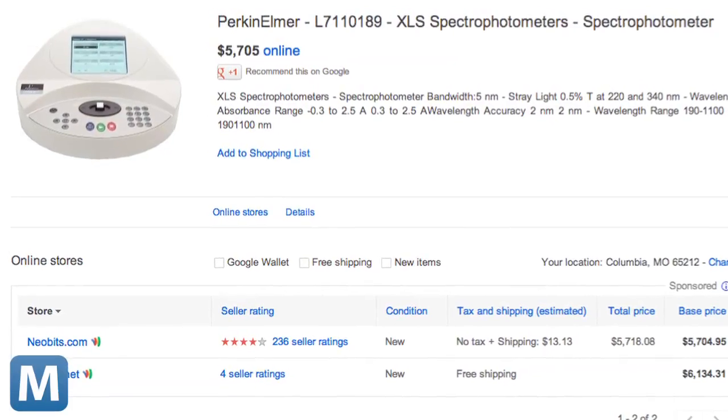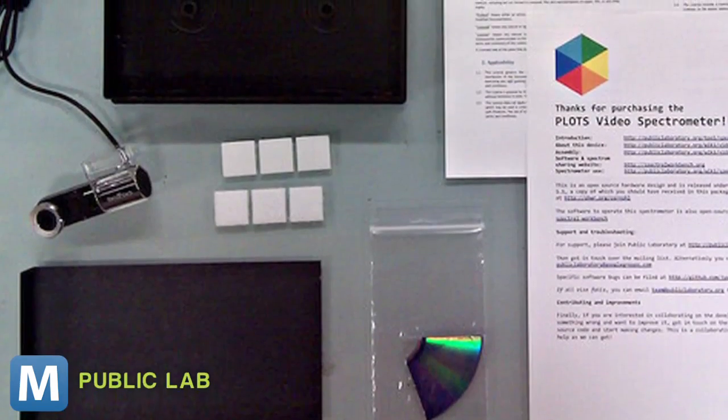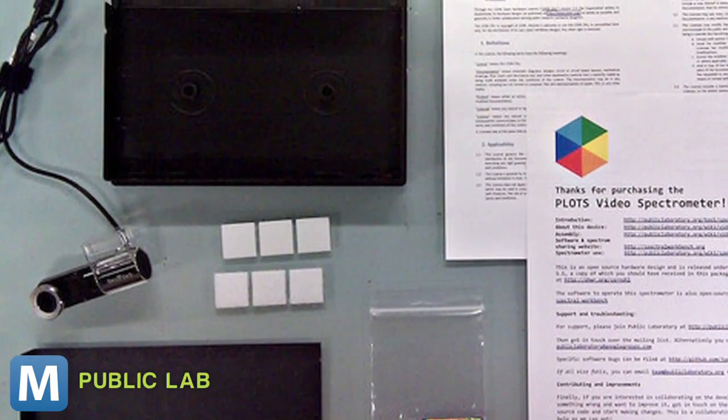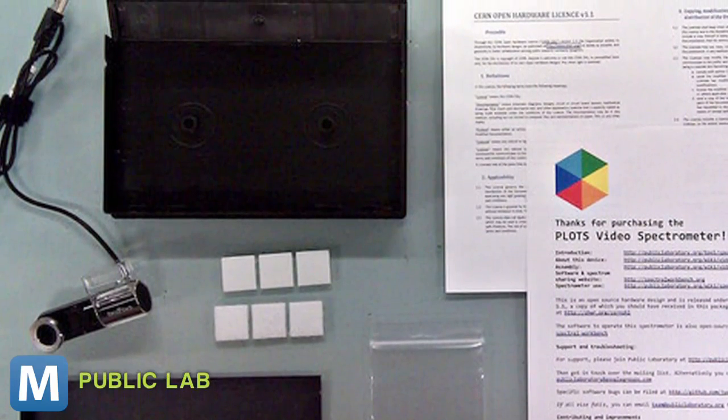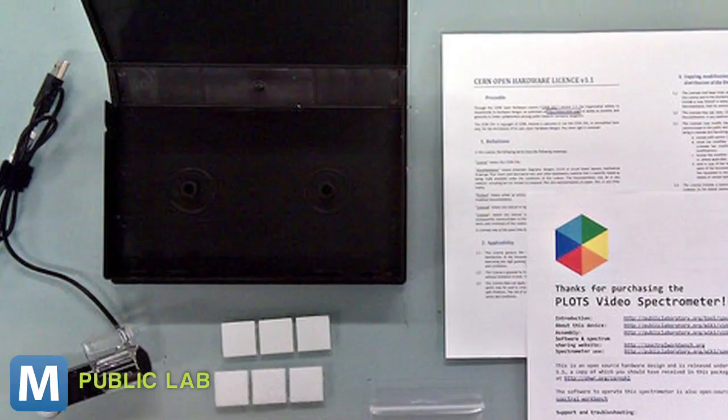To measure this, you normally need a spectrometer, which could cost you thousands. Now there's a Kickstarter project that will give you a spectrometry kit for $35. It's a DIY kit that includes a piece of DVD-R, an empty VHS box, black paper, Velcro, and an HD USB webcam.